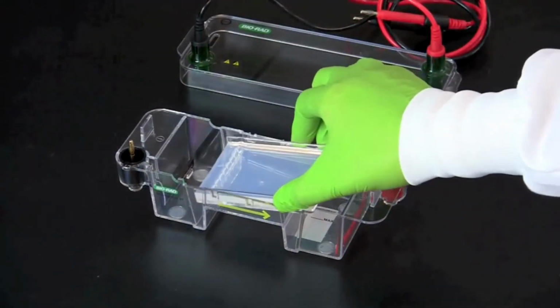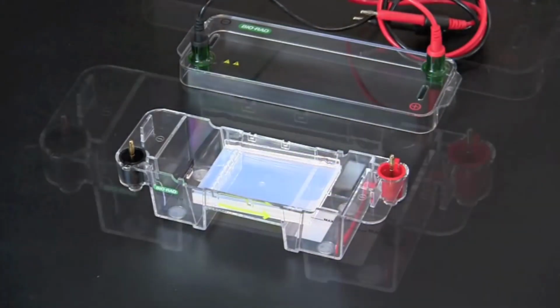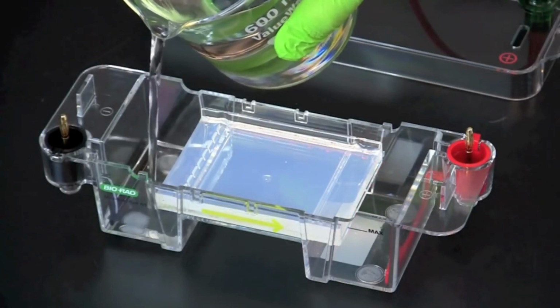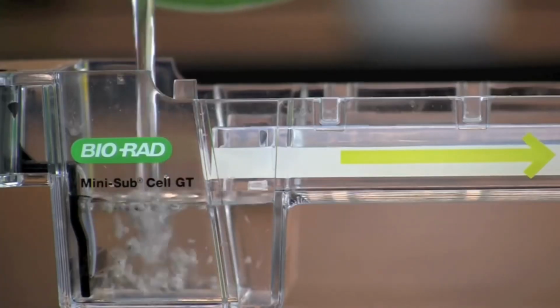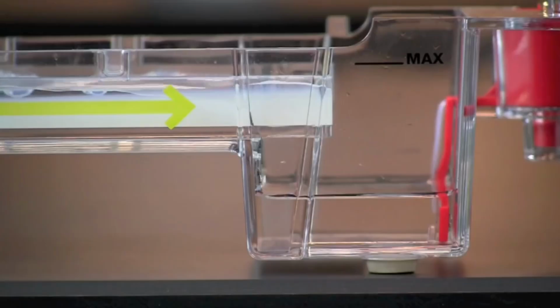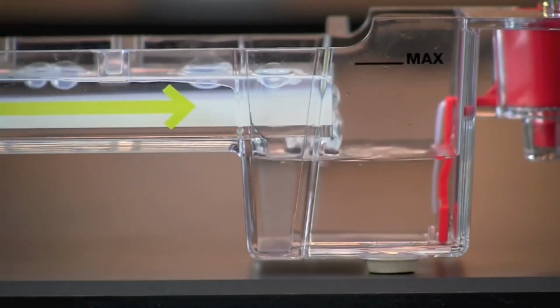Now we place the gel into the tray. Then we have to add the electrophoresis running buffer. It's important to keep filling the reservoir until you get to the max line that covers at least 2 millimeters above the gel.